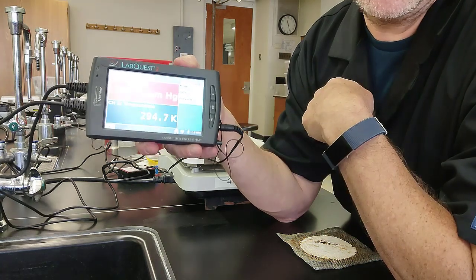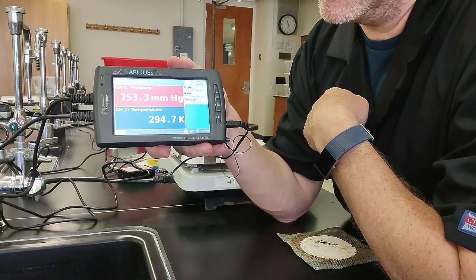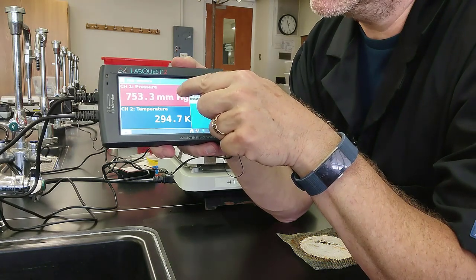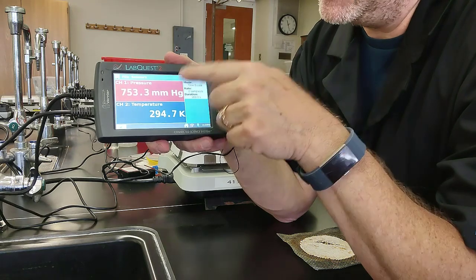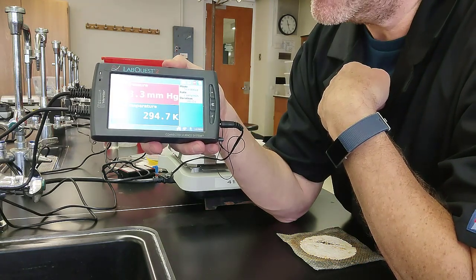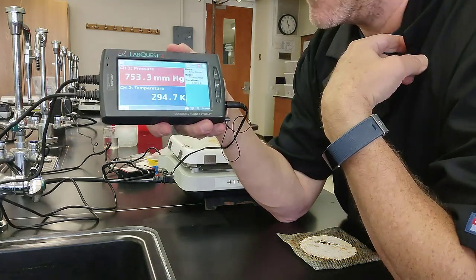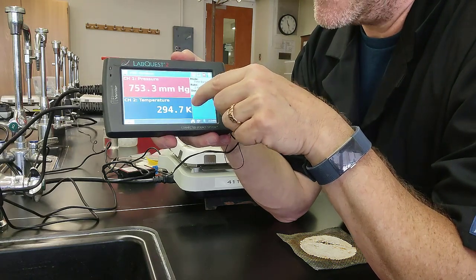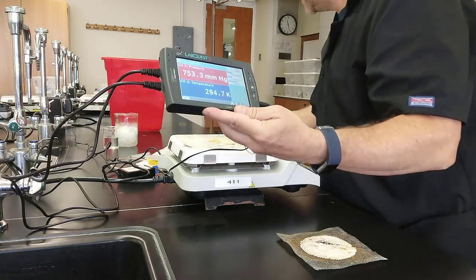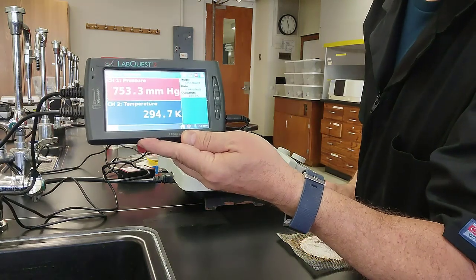We're just looking qualitatively here. We're not doing any sort of quantitative analysis. So we're just looking at what happens to the pressure when the temperature goes up, and what happens when the temperature goes down. We could do it the other way, change the pressure and see what happens to the temperature, but that's not the experiment that we're going to do. So I went ahead and changed the display into units that are more common for us in our discussions in class, but you could absolutely leave it in degrees Celsius if you want to.